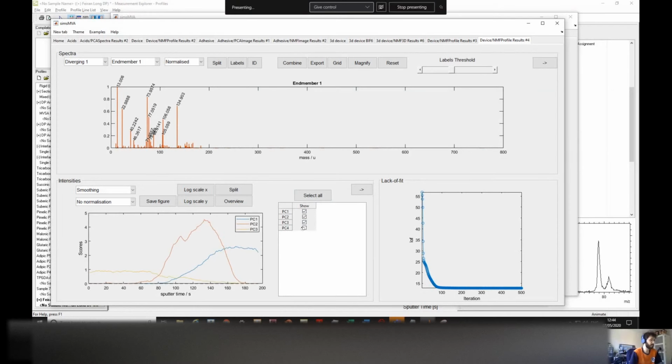So now you see here it's just showing the data at the interface, and it shows sort of 2 layers at the interface. I said we printed 3 materials, right? So we had the substrate, the first one, the second one, and the thick one on the top. Now instead of processing all the other layers that are supposedly the same, we're just processing the points at the interface. So it helps sometimes. But apart from this, everything else is the same: the end members, etc., and how to deal with the data.